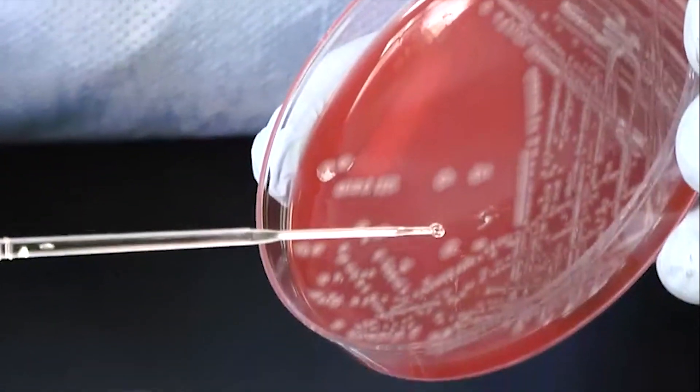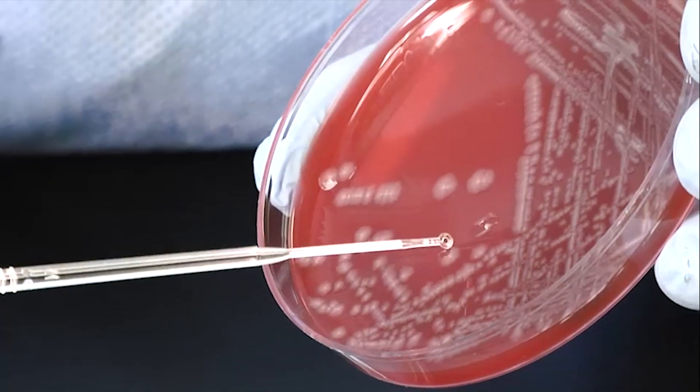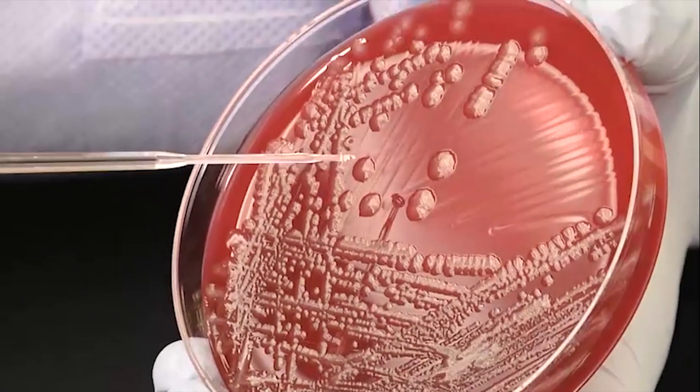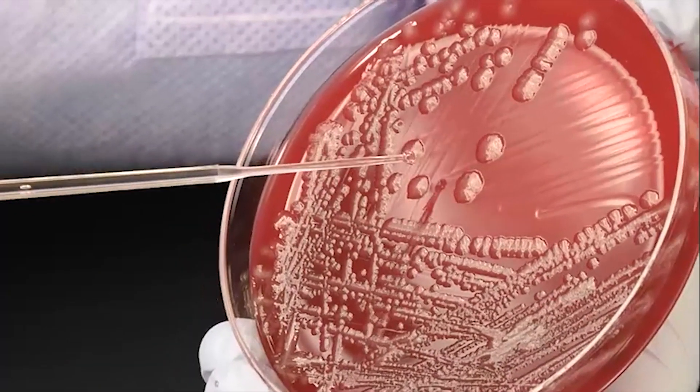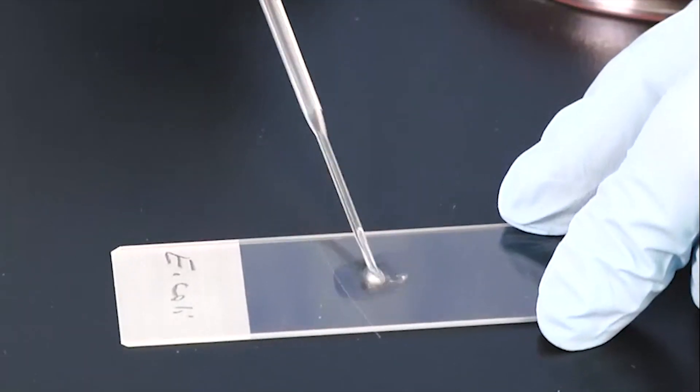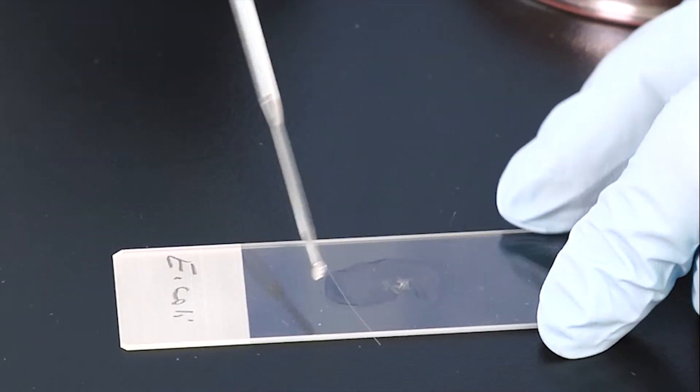This same procedure is followed when you are taking an isolated colony from culture media. You would put a drop of sterile water on a clean slide. Using a sterile loop, remove an isolated colony from the culture plate and gently mix it with the sterile water.